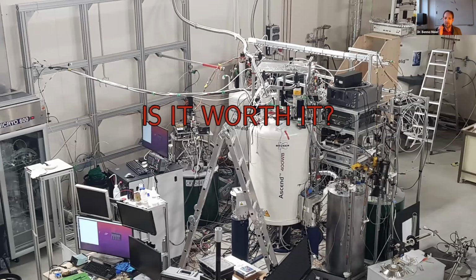And to know whether it's worth it, we need to first understand what actually is the sensitivity. If we want to do this hyperpolarization to enhance sensitivity, then we need to first understand the sensitivity of a regular NMR experiment, and then we can see how much we may be able to gain with hyperpolarization.